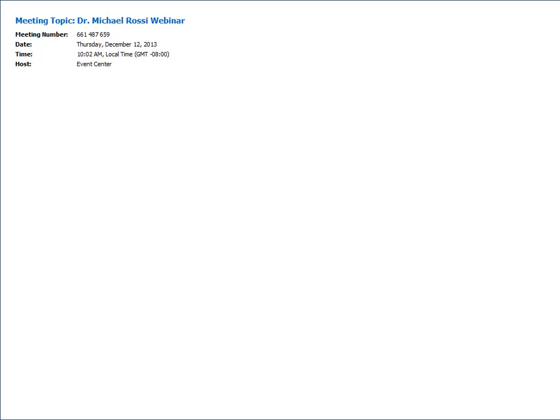Great, thanks. So we do have a question coming in. Somebody is excited to hear more about the next steps, and the statement is that the validation shown here is great. They're asking what your thoughts are about the discovery work that can be done with this, and maybe bridge that with finding the 8X fusion that was shown with structural variation, and rather than validation, showing that it was a faulty call by the RNA-seq data maybe, and tie that together with your thoughts for moving this into a much more discovery realm.